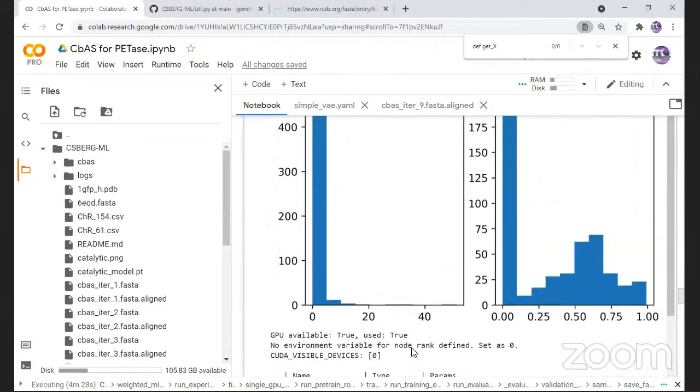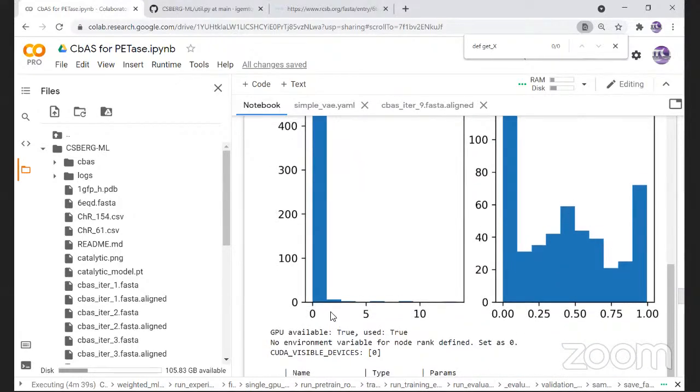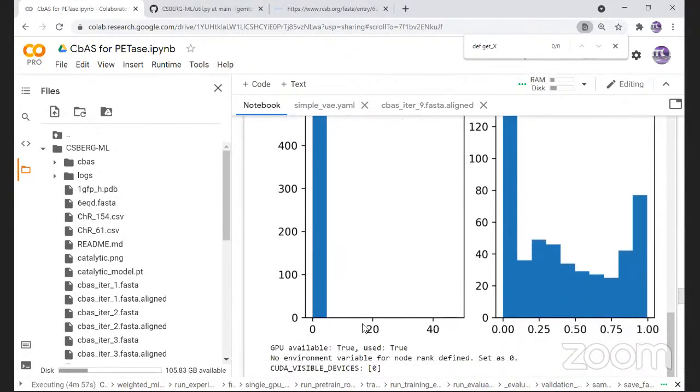And these weights are increasing. Oh no. Well, it started all at 1. And then something was like 40-ish. Okay. This doesn't really convey that much information. This spiked up a little bit. Okay. This part's interesting because there's sort of this trade-off then, right, between how large this thing can get versus how large this thing can get.